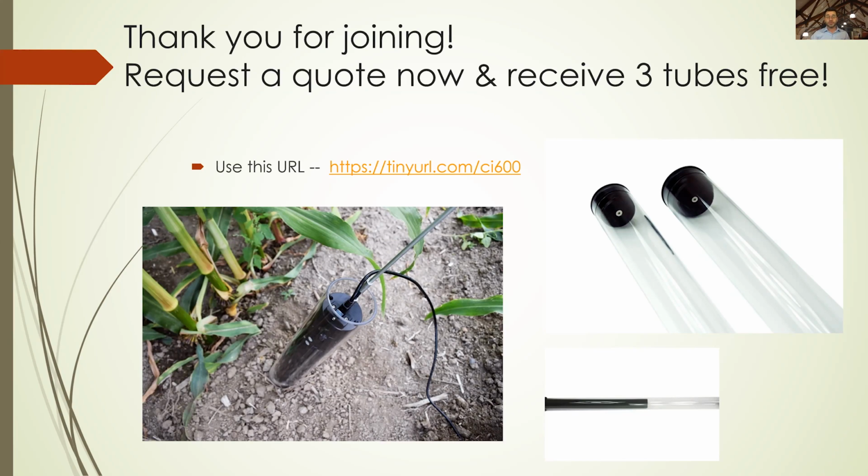The next question is, will the tube influence root growth? Acrylic tubes have been long studied, and how it's installed is the biggest factor affecting root growth. Making sure that the environment and the soil around the tube are very similar to how the roots were growing in the rest of the plant is very important. That means making sure the soil is not compacted, that it has a similar moisture rate, that you're not leaving large holes in it, and that UV light is not getting in the tube. The insulation caps help with the UV light, though I definitely suggest that if large parts of the tube stick out of the ground, you make sure those are wrapped up. Some examples have been PVC, duct tape, or even white paint, just some way to keep UV light from getting down into the ground and inhibiting root growth.